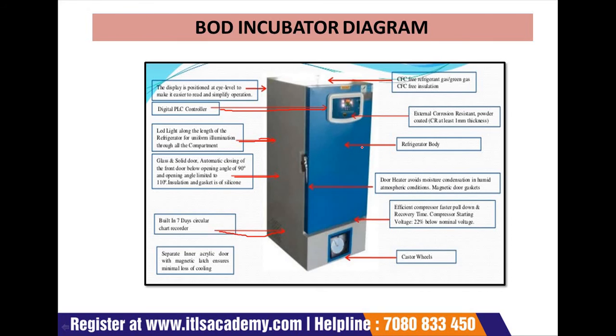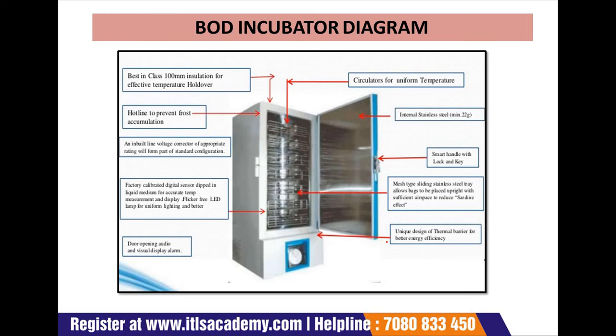And here is the refrigerator body, and this is the door heater, and this is the efficient compressor, and this is the caster wheels. So by this way you can check the outer and whole body structure of the BOD incubator. Now in the next picture you can also see how BOD works. This is the inner structure and outer structure, both you can see in this picture.